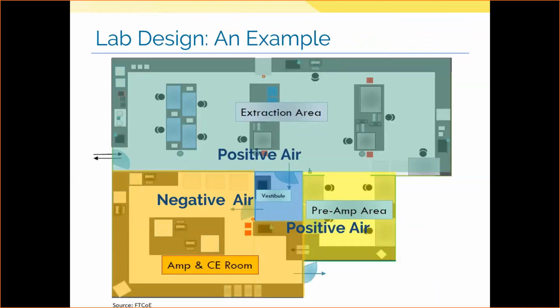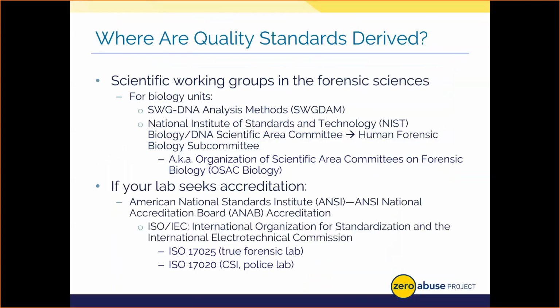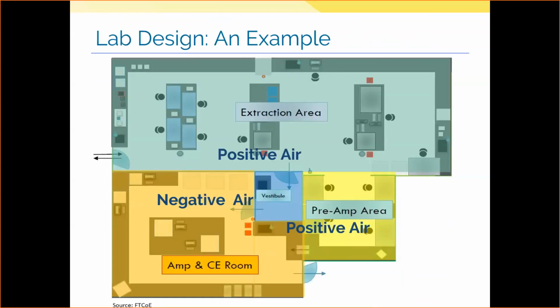Now, because we discussed the need for these different workspaces to separate out pre and post PCR so we don't wind up bringing in DNA and contaminating your items, I did want to show you what an ideal layout looks like, if we had all the money in the world. Oh, I'm sorry. There we go, back to the lab.